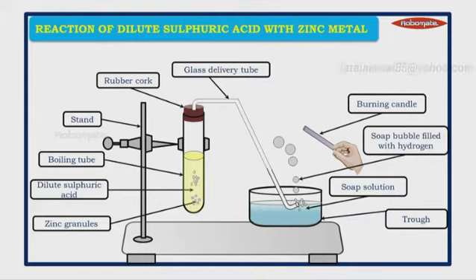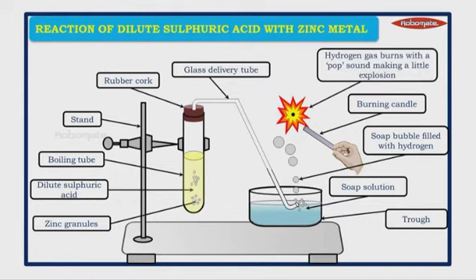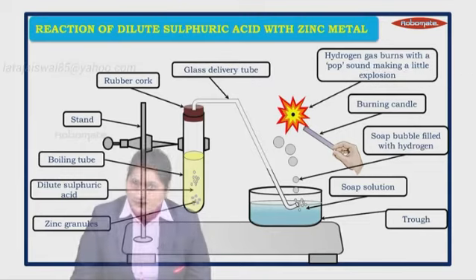We are going to test this gas with a burning candle, and you will see the gas is burning by producing a pop sound. It is none other than hydrogen gas. Hydrogen gas burns with a pop sound, making a little explosion, confirming its presence.